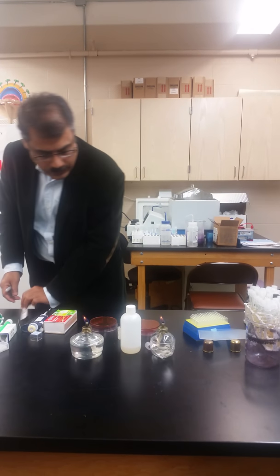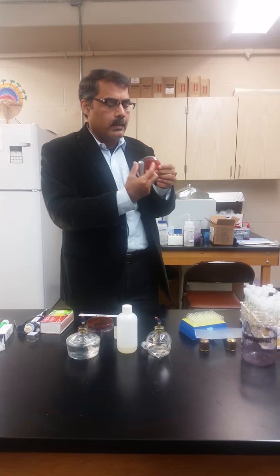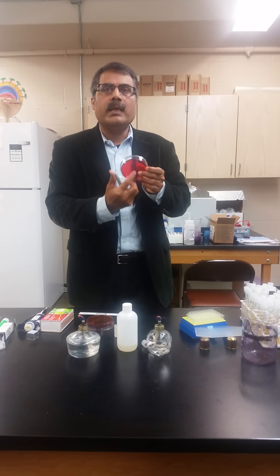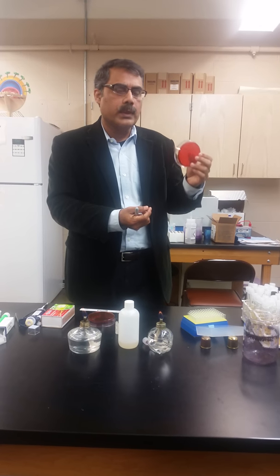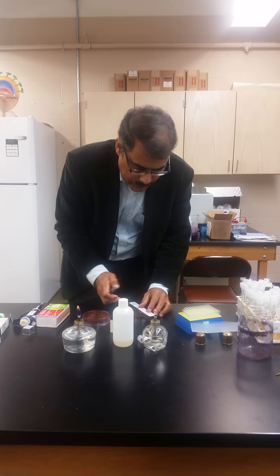Of course, you can't see them right now, but this is basically a rough patch here, which tells you that you can make any kinds of quadrants, or this is kind of a marker on the bottom of the dish. So you can use it for many purposes, okay, for numbering and stuff like that.